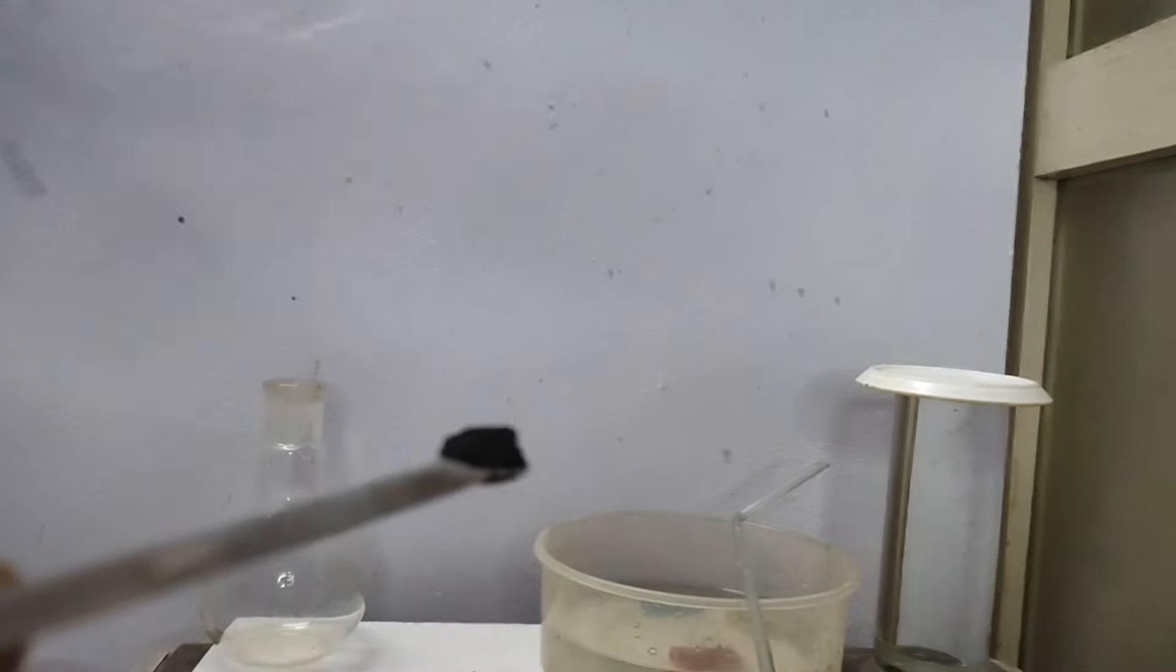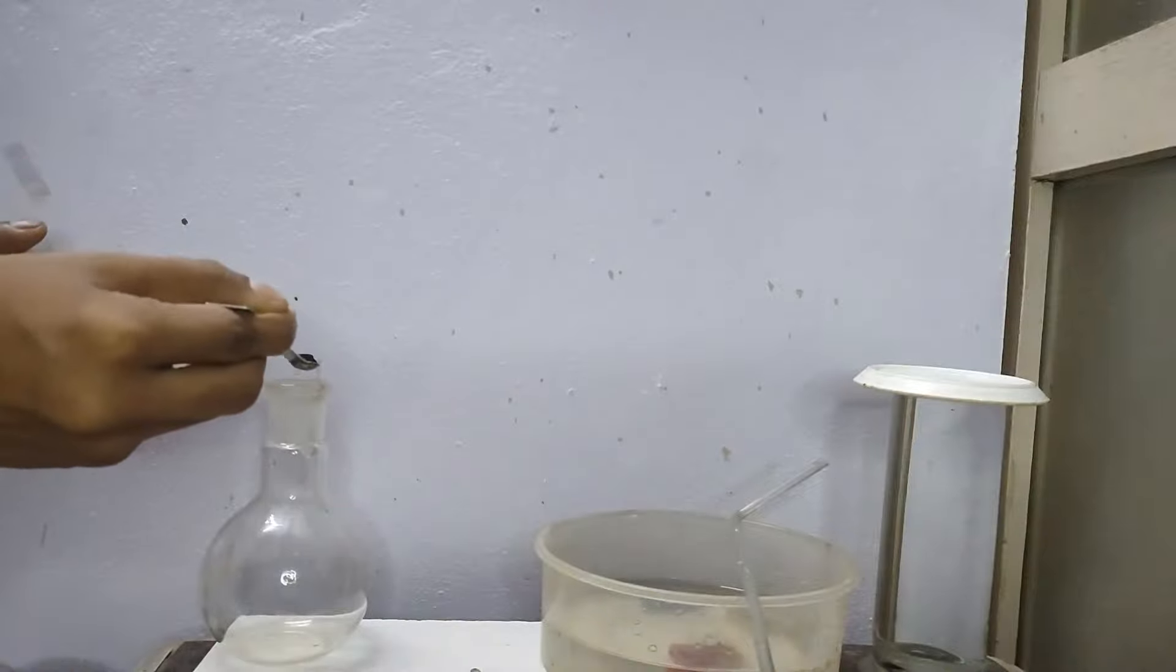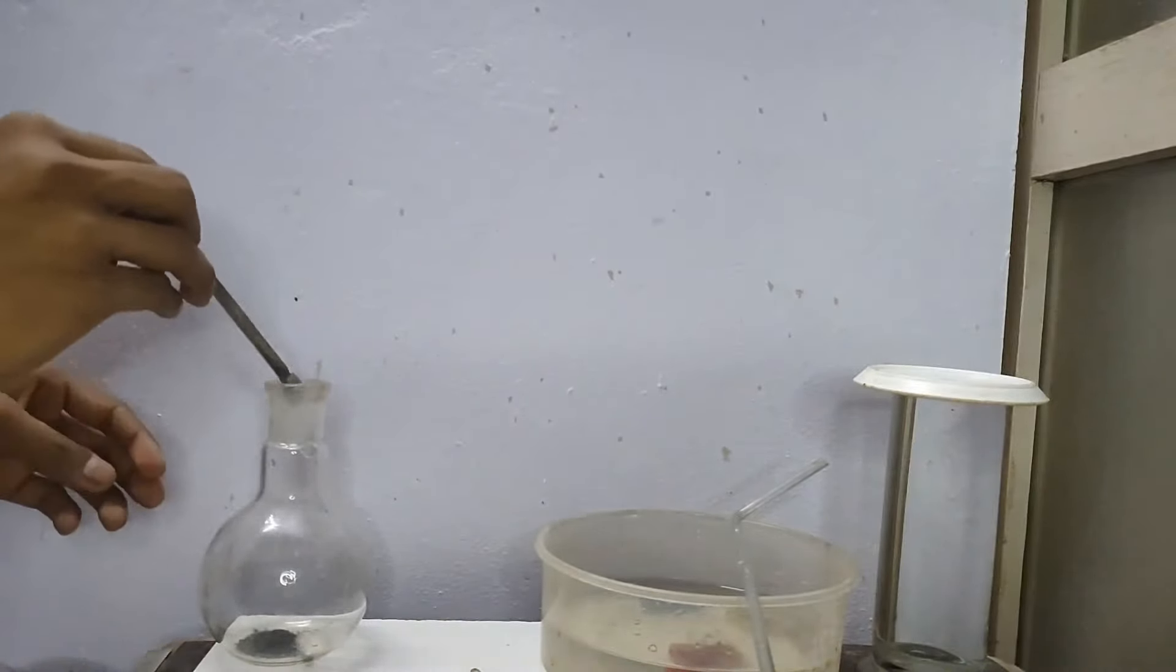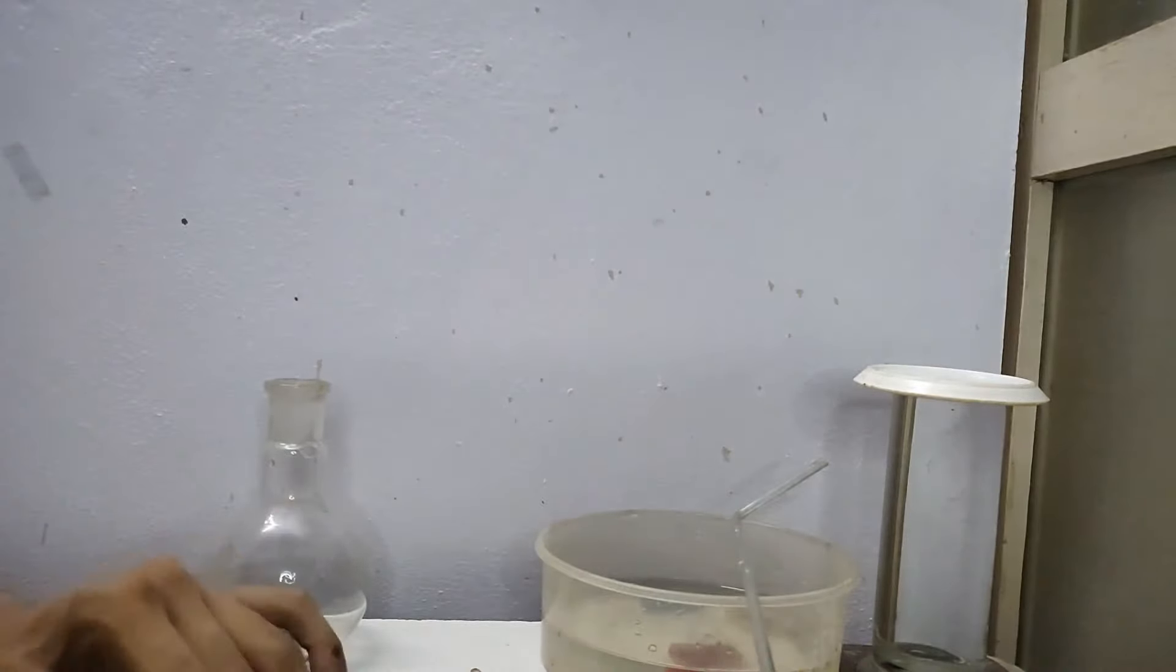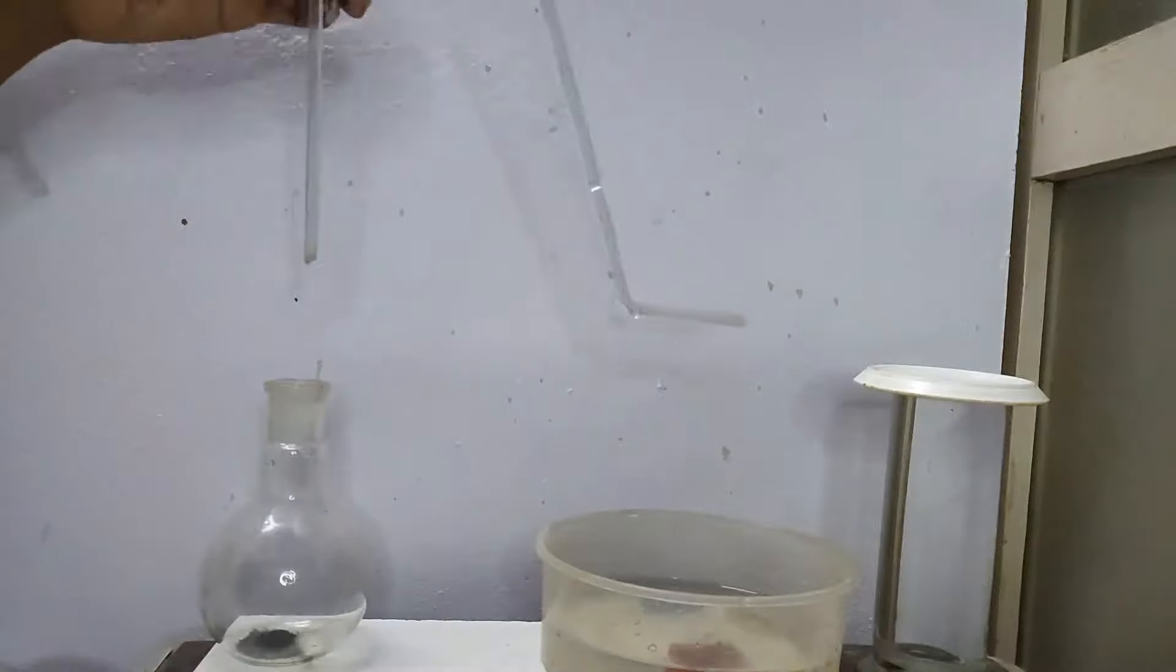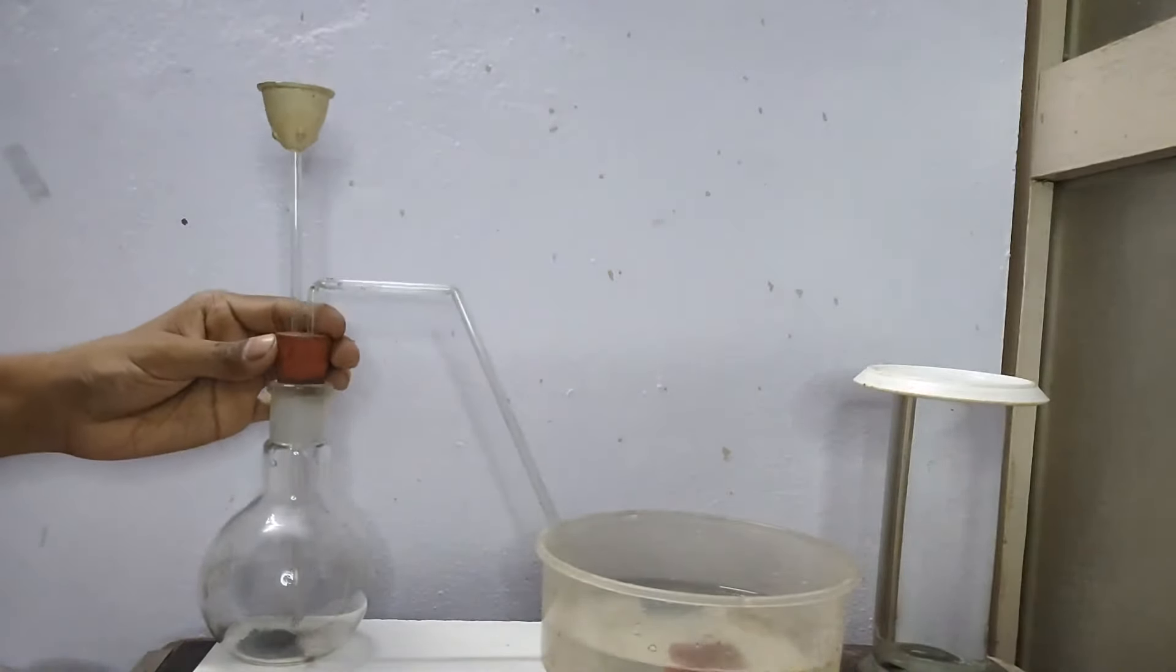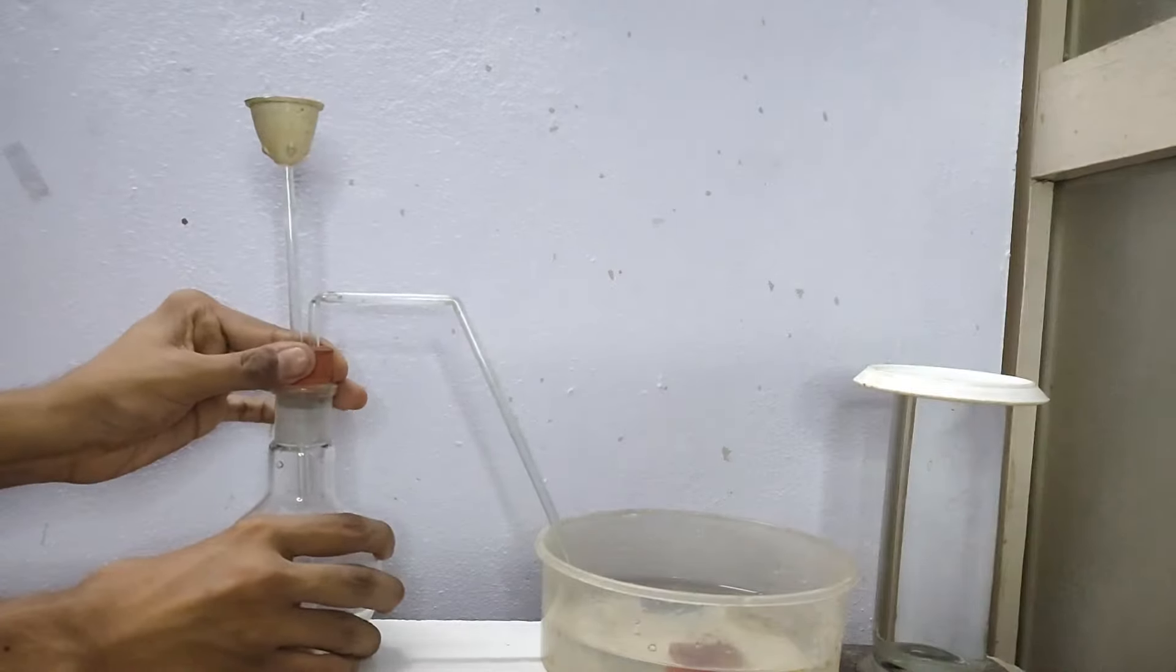And then I will take a spatula of manganese dioxide. You can see that it is a black powder. This will work as our catalyst. It will increase the rate of reaction but will not take part in the reaction. So as much you add, it will not get consumed. So a little quantity also is sufficient to facilitate the reaction.